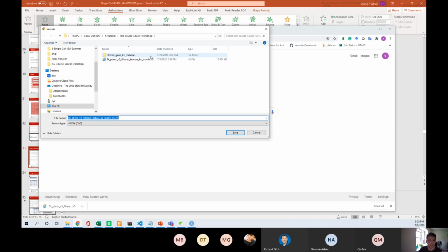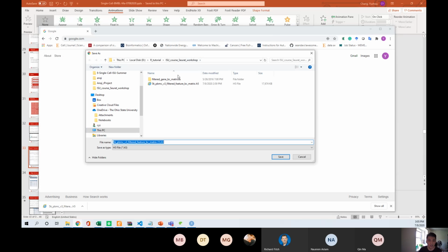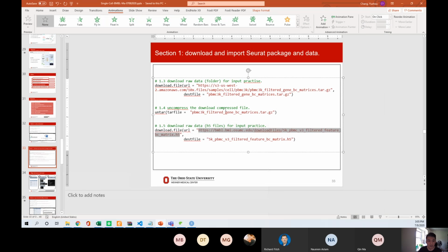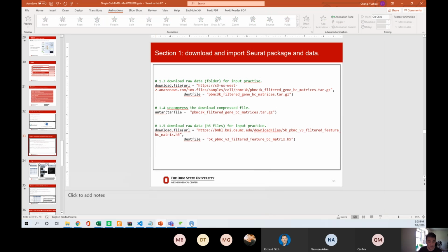It will give an instruction on where you should download. You should also download into the directory where you will perform the major analysis, so please build a new folder for this file. Okay, you can save it and download it. I believe it works now.